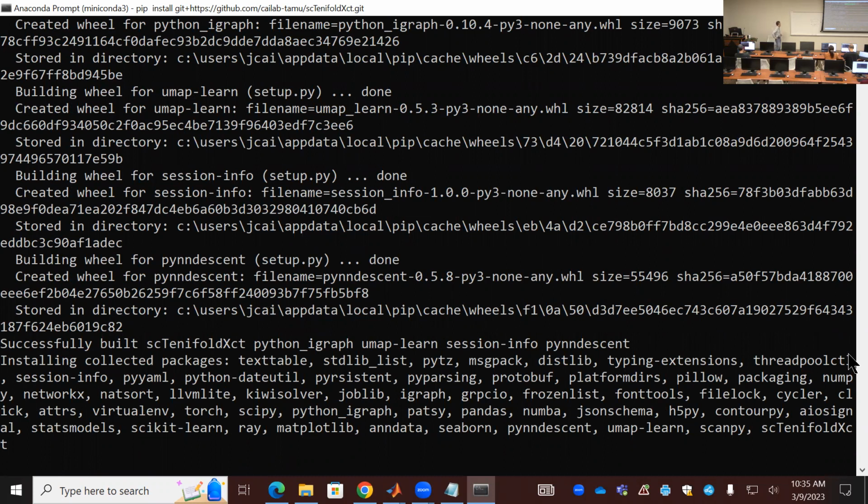The reason Yongjian developed this in Python is that within this pipeline, we need a neural network, and it is very convenient for him to use these established packages. Python provides a lot of other third-party tools.